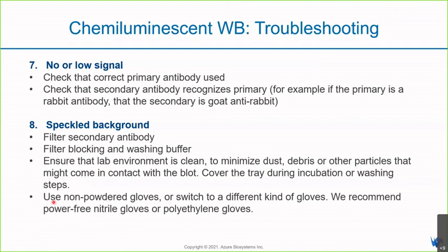Use non-powdered gloves, or if you're using standard latex gloves, try to switch to a different kind of gloves. We recommend powder-free nitrile gloves and polyethylene gloves that will significantly improve this speckled background caused by powders or dust.